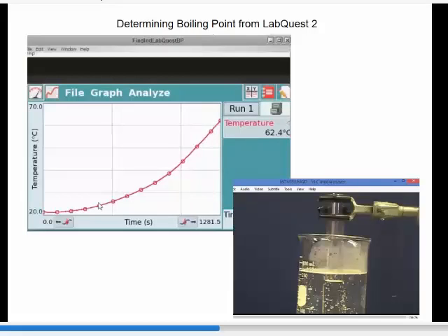In the corresponding video, what you'll end up seeing is that the water's got the bubbles in. It looks like it's starting to boil. The stuff inside doesn't particularly look like it's boiling, but vapor is starting to drip off of the temperature probe. So what we're going for here is we want to see what the boiling point is. The boiling point is going to be the point in which the vapor pressure of the liquid equals the atmospheric pressure on it. If I get to the boiling point, the liquid will turn into vapor, it'll hit the probe, it'll condense, it'll fall back down. Actually, the temperature will flatten out. It's the same sort of thing in boiling. So what we're really looking for is a flattening of this curve at some point.